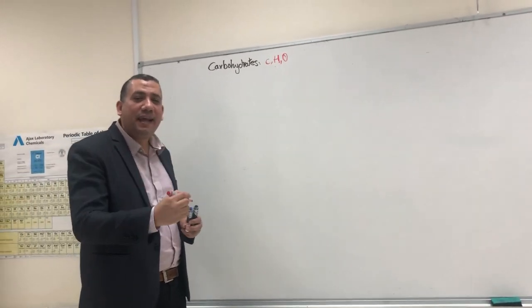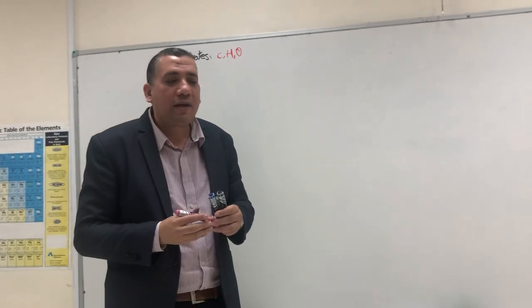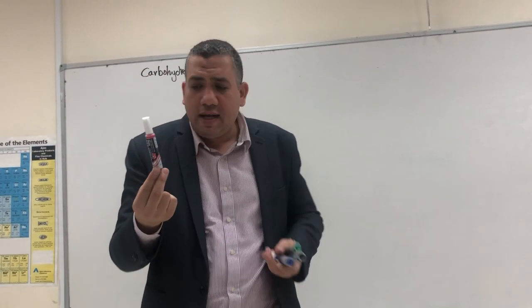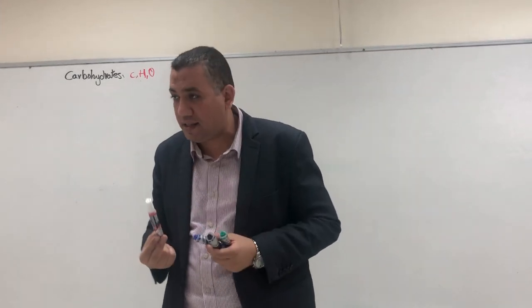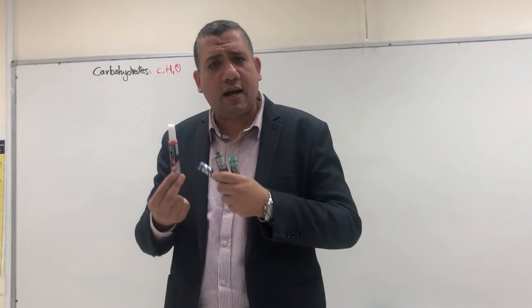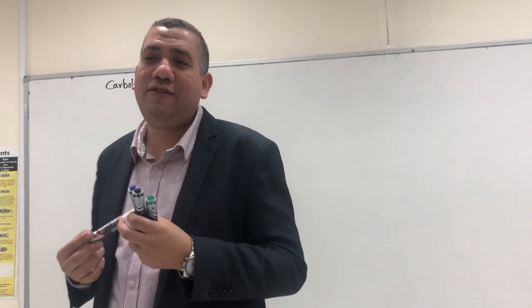Now I will explain the theory of the lab, which is called carbohydrate scheme. For example, I have a tube here. This tube includes an unknown solution. I need to understand if this solution is carbohydrate or not, which is called carbohydrate scheme. Now, what if it's a carbohydrate? Which type of carbohydrate? Is it monosaccharide or disaccharide or polysaccharide? So here I need to differentiate between the carbohydrates.